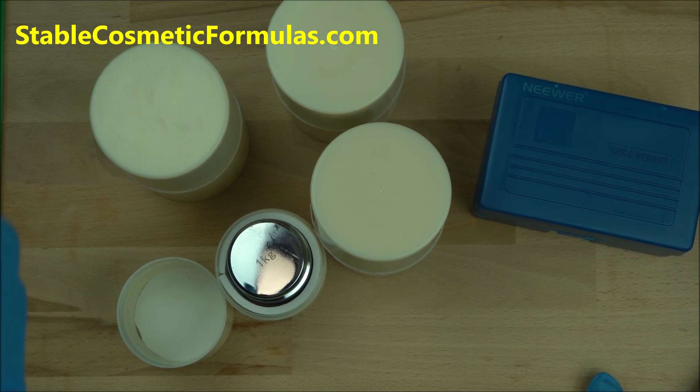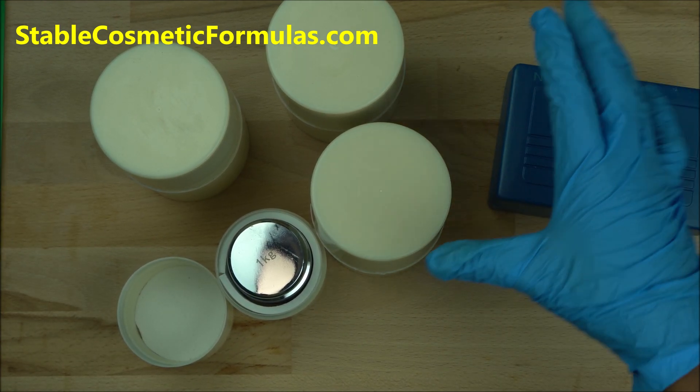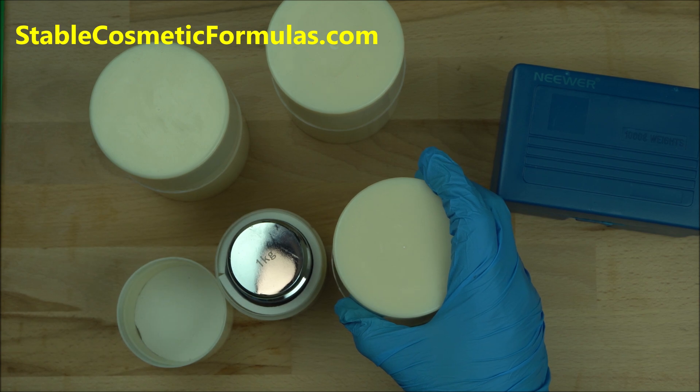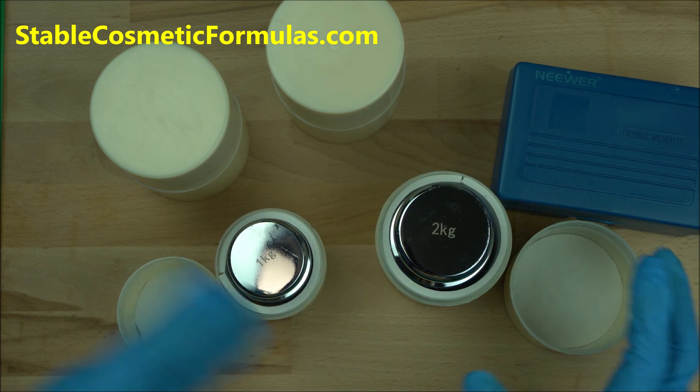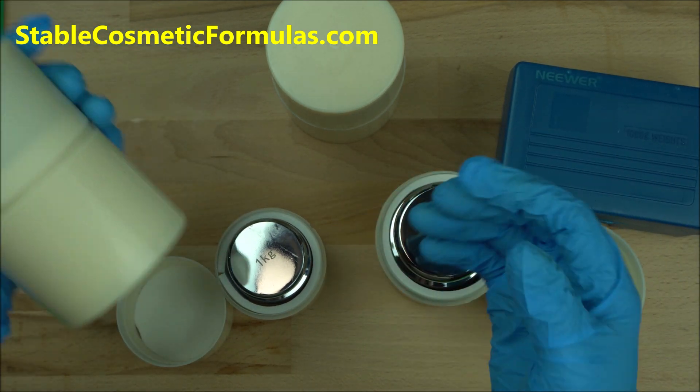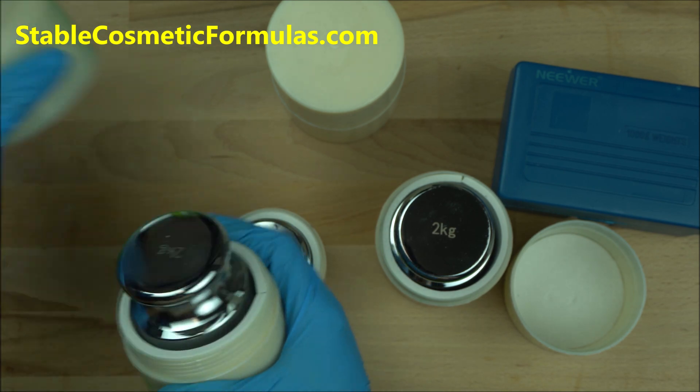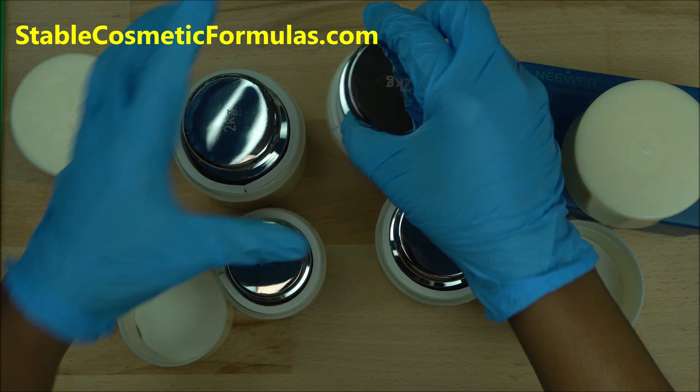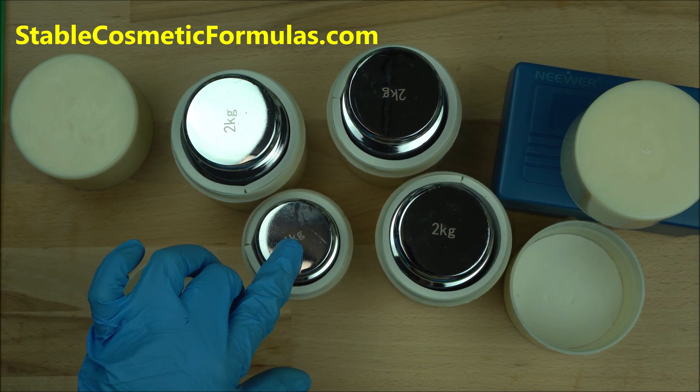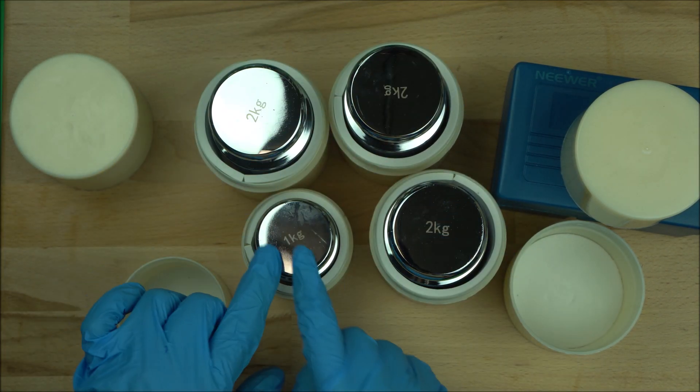As you all know, I like brands, I like quality. So today I'm going to show you the calibration weights that I use at my cosmetic formulation lab. Here I have different sizes. I have two kilograms—I have three two-kilogram weights, okay—and also I recently got this one kilogram.